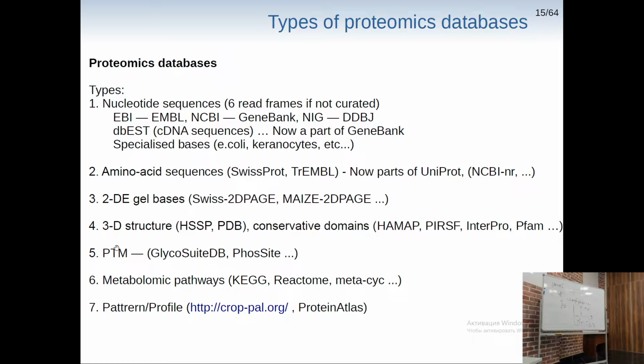Of course, we don't just want proteins per se, we want to be able to see which functions the proteins take part in. And I think that you probably already used KEGG or MetaCyc or Reactome databases, because those genes and those proteins have so-called gene ontology annotation, which functions and which localization inside the cell they have. And if you have just two samples, you can have a lot of differences in proteins, and it's not easy to analyze them just one by one.